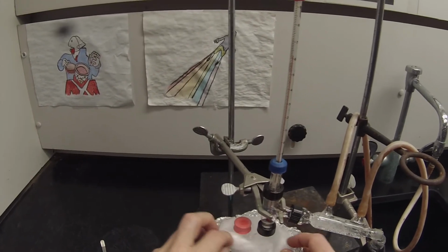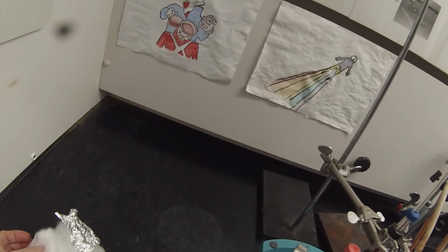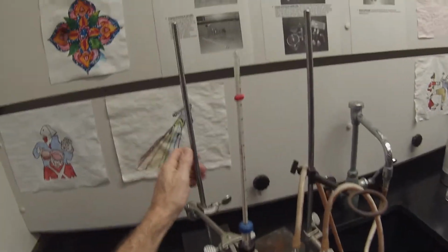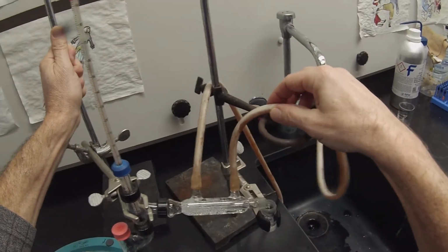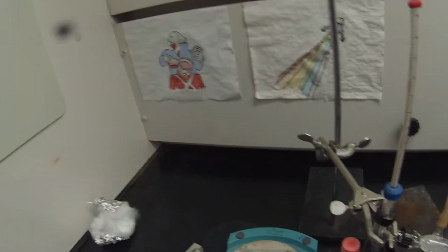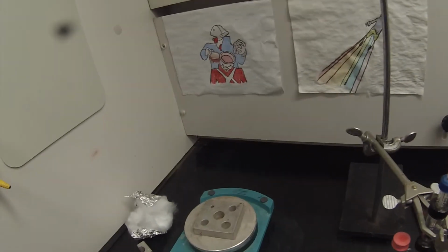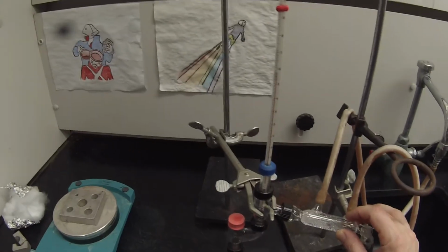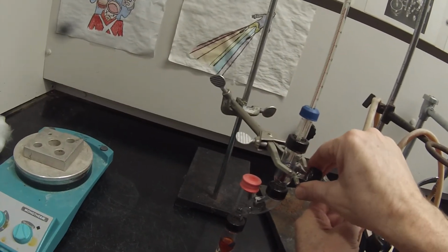I'm going to disconnect this, pull out the glass wool. Set those aside. And now what I'm going to do is kind of just lift this up and pull that out so it can start cooling. That guy off, unplug it. And I want that little bit of liquid there. I'm going to unscrew this. I can turn off my water.